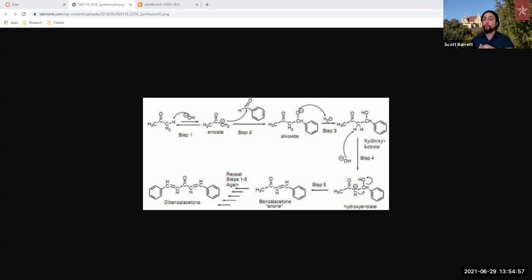And in this case, what you would create on the side, since you're pulling off the chlorine, and additionally, the amine is attacking, now you're leaving a proton. So instead of creating water, you're creating chlorine and hydrogen, which is hydrochloric acid. So just remember, in the case if you do use a chlorinated system, if you use something like sebacoyl chloride, decanedioyl chloride, any acyl chloride is what these are called, you will create hydrochloric acid instead of water as your side product. And then going forward down here, remember to make sure to review the process of the reaction.